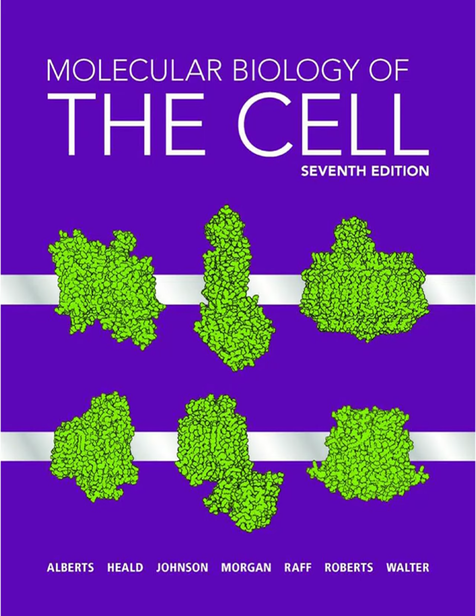Good question. Confocal is often better for thicker, highly scattering specimens where there's a lot of blur to reject optically. It's also often simpler to implement. Deconvolution can be better for dimmer samples or situations where you want to minimize light exposure, as it collects all the light first, including the out-of-focus stuff, and sorts it out later. But deconvolution can struggle deeper into tissues, say beyond 40 or 50 microns. And even confocal has limits for deep imaging.